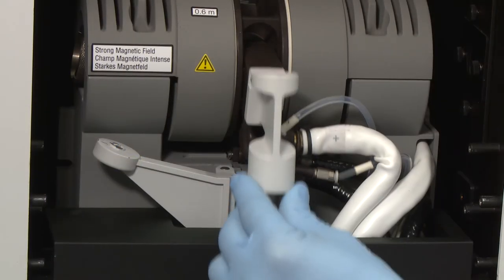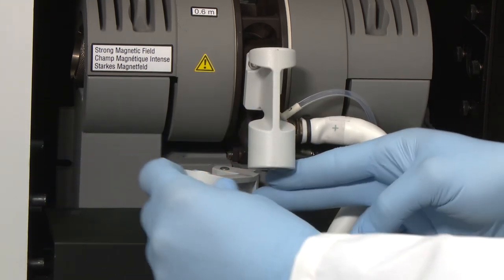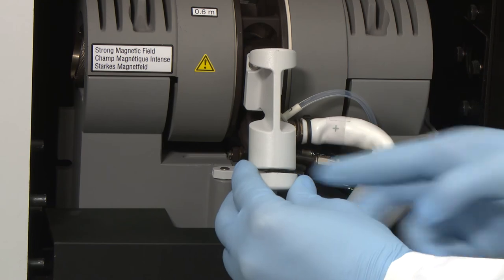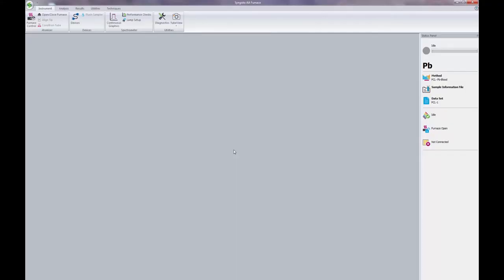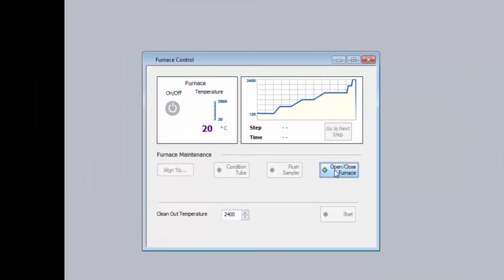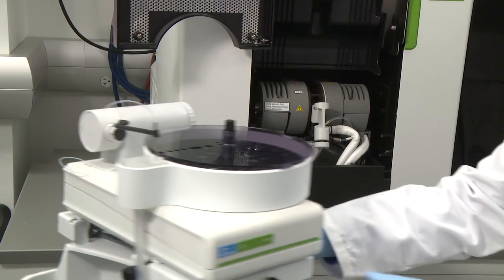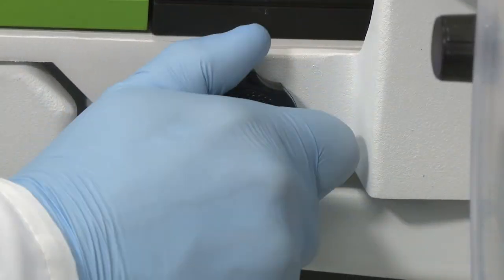Carefully tilt the front contact housing up into the closed position and swing the support lever underneath the front contact housing. Activate the pressure that holds the furnace closed by going to the furnace control window and selecting open close. Carefully swivel the furnace auto sampler back into place and secure it with the large securing knobs.